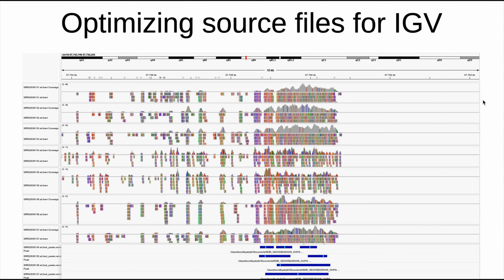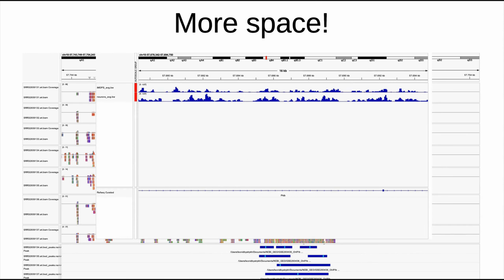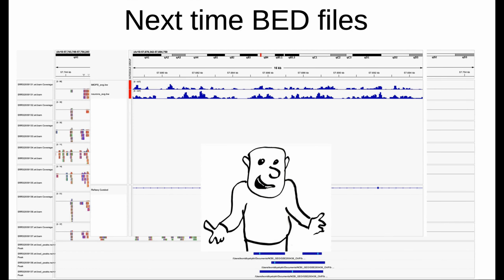No, not really. Previously I showed you how you can convert BAM files, which are shown here in the IGV viewer, into bigwig files and then take the average of the bigwigs. Then instead of such a busy figure you will have only two tracks and lots of space for other tracks. But the story was not complete yet, because next to BAM files you have bed files, and loading individual bed files for every sample sounds not optimal.